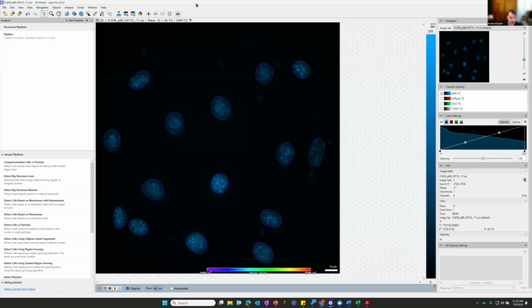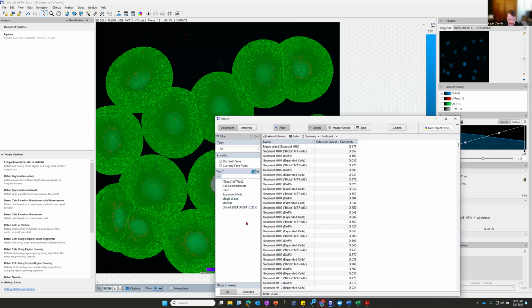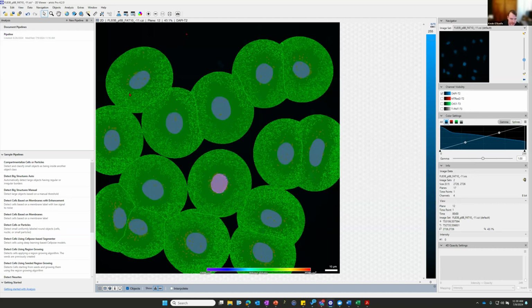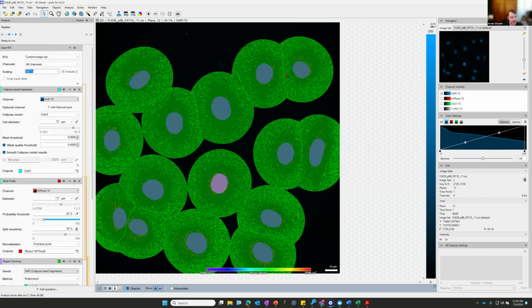Okay. I've already gone ahead and created this. Let me go back and change these to opaque again, just so they pop a little bit more. I already created a pipeline and ran it, as you can see. So what I would recommend is usually just start with one of those example pipelines, because then you can get an idea on what at least the order should be. And you can always work off, add, or change it up however you want. So if you do, for example, a neuron tracing sample pipeline on your own data, and you find it's just not that good, maybe it's getting like 80% of the way there, maybe add to that sample pipeline right beforehand a pre-processing step that does a little bit of background correction to improve the contrast of those objects. So something like that, I think it's good to start with an example pipeline, and then build off of that.